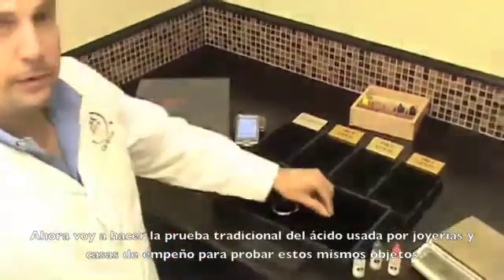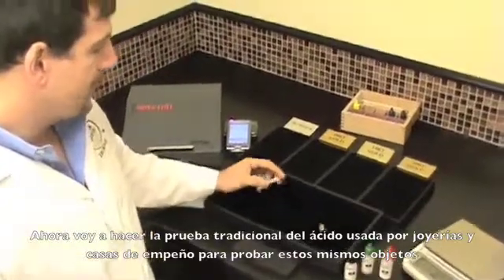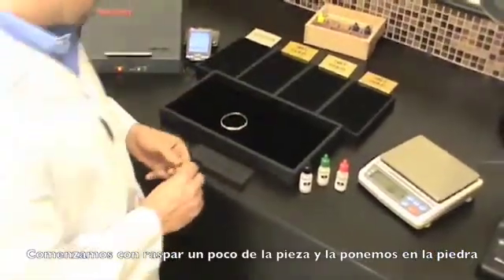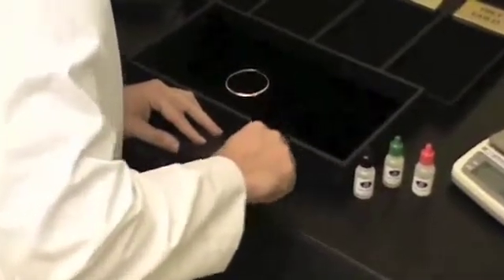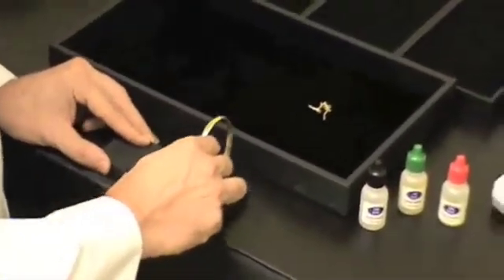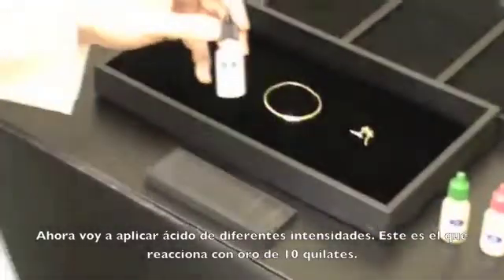Now I'm going to do a traditional and common acid test that's used by jewelers and pawn shops to test these exact items. We start by taking a small filing and applying it to a stone, then I'm going to apply acid at various strengths.